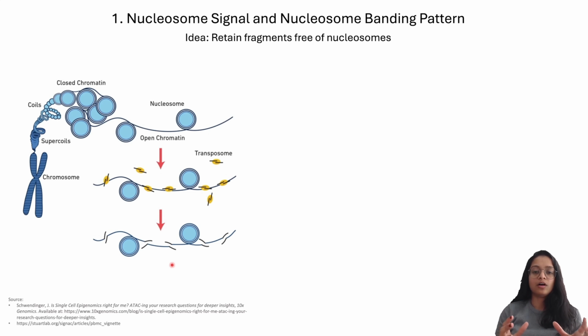So these nucleosomes are joined together by a DNA that runs between them, which is called a linker DNA. Now, the amount of DNA that is bound per nucleosome can be determined by treating the chromatin with an enzyme that cuts the DNA. One such enzyme has a specialty to preferentially cut the linker DNA between the nucleosomes well before it cuts the DNA that is wrapped around the octamers.